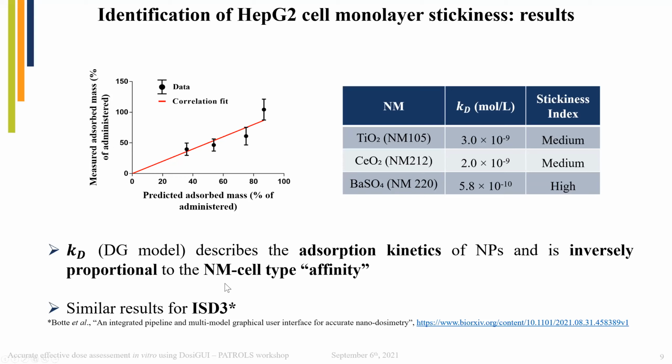So that's some of the validation experiments that we did, and that one could also do in-house if one has access to plasma emission spectroscopy or other quantitative methods.